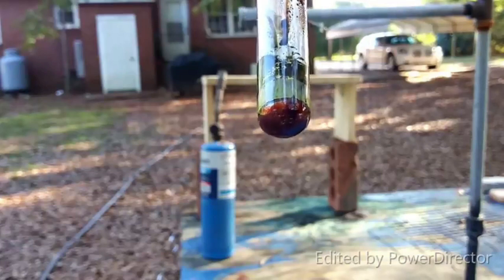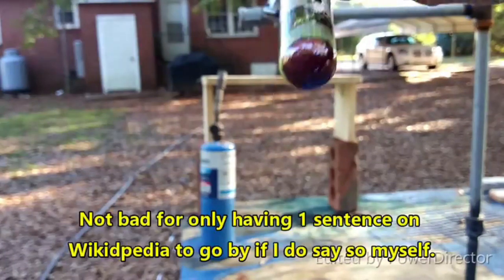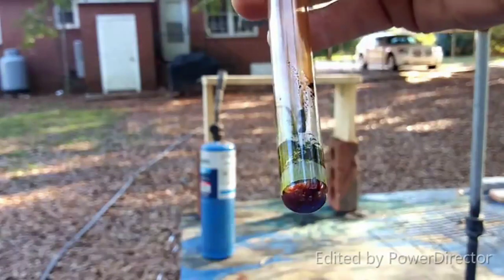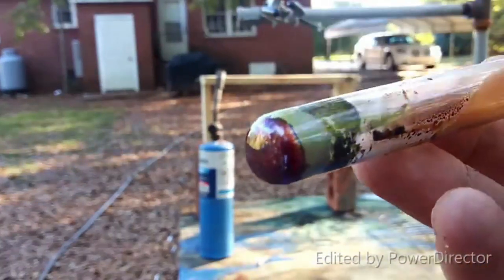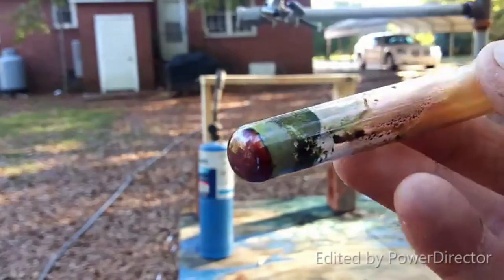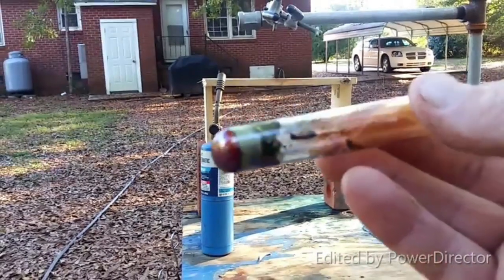There we go, people — indium monoiodide. That is the shit, that is so cool! We've got indium triiodide right above it. That is so, so damn neat! So there you have it, people — indium monoiodide. That is just so damn cool. That really is.